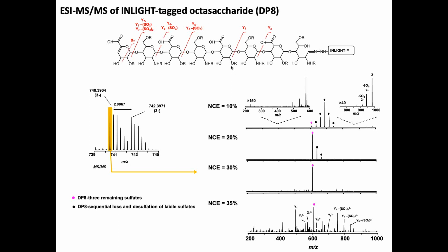All right. So in heparan sulfate, with some of the challenges, separation, which I haven't even touched upon, but a big ticket item again is sequencing these guys in the mass spec, which is a huge, huge challenge. And the key is that you're losing all this information, even under soft conditions with electrospray. You lose these sulfates, and that's where all the information lies for us for heparan sulfate.